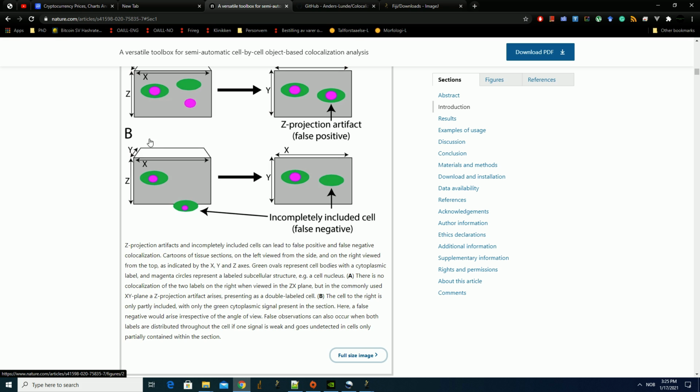Another problem, which is typical for those analyzing signals coming from a subcompartment of a cell, such as transcription factors found in a nucleus, is this: the subcompartment can be outside of the image data, and then it appears as a false negative. The plugin addresses this by, for example, showing only signals from the subcompartment.